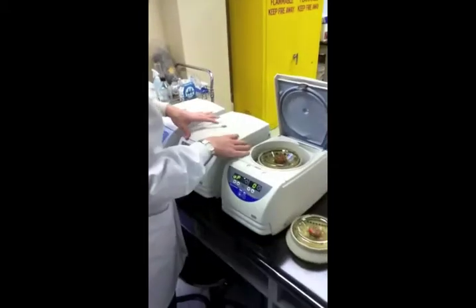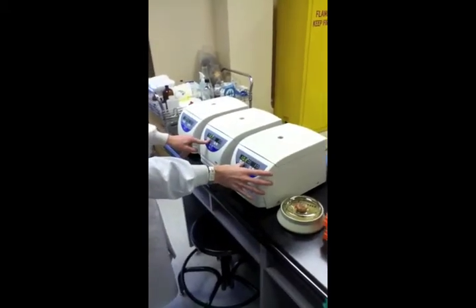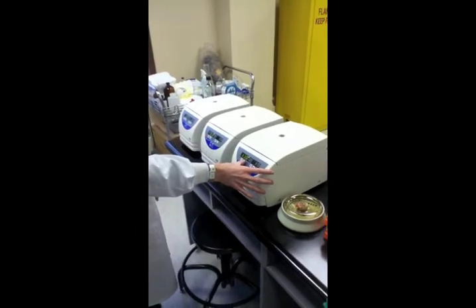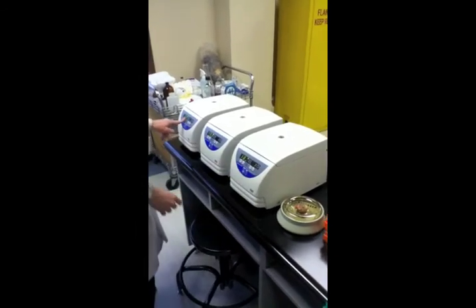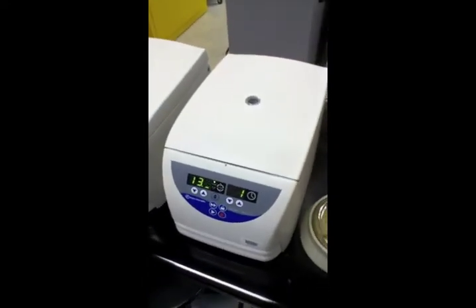Centrifugation. High speed. How long? 5 minutes? Sure.